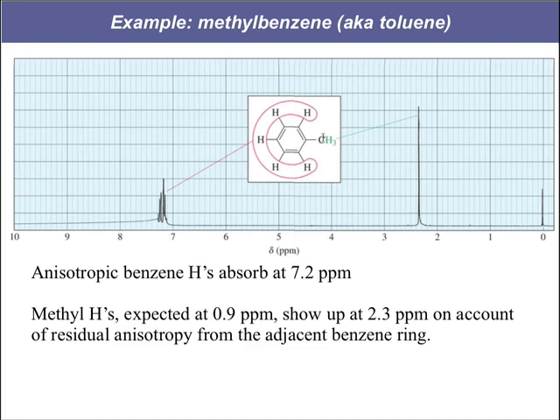They are on a carbon that is on a benzene ring. They have a close proximity to the diamagnetic anisotropy of the ring, and that pulls it downfield a little bit. These methyls are feeling a little bit more magnetic field than they normally would. So they need less to be applied for them to get into resonance.